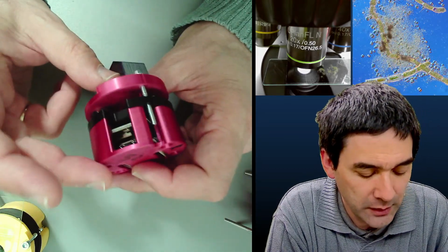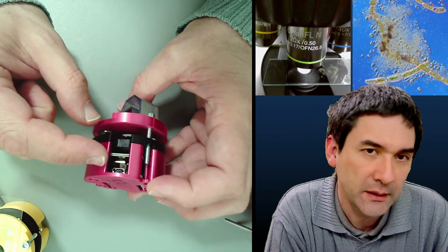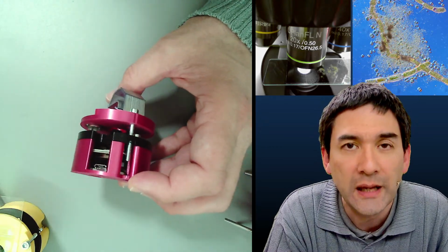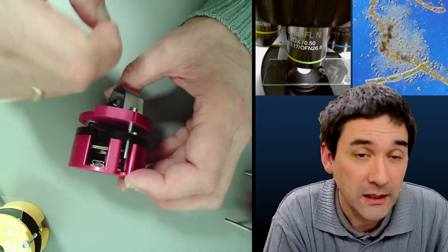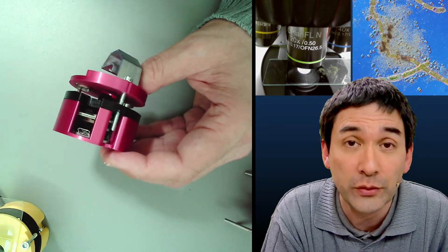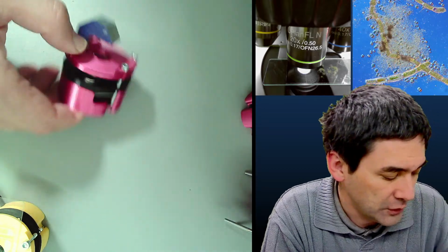Over here you have a USB connector, which is used as a power supply, of course. If you want to go a little more advanced, you can also program the camera this way. For example, if you want to do time lapse, or program it to automatically take a picture every few seconds, that's also possible. Some people have used the camera for animal watching, automatically triggering the shutter release. All of these things are possible, and I can show you here on this module.